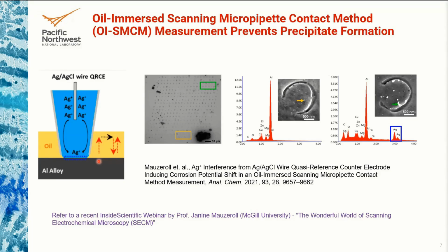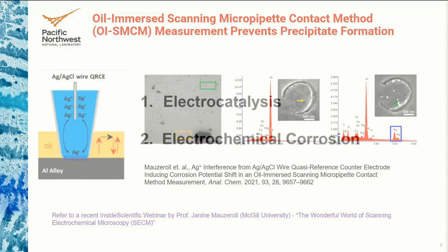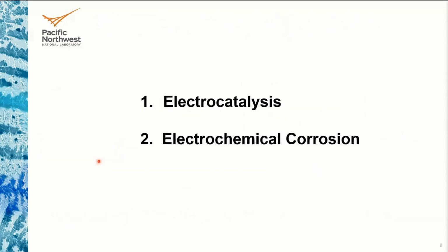So having said that, I'm going to talk about the application of SECCM in two fields today. One is electrocatalysis, the other one is electrochemical corrosion.